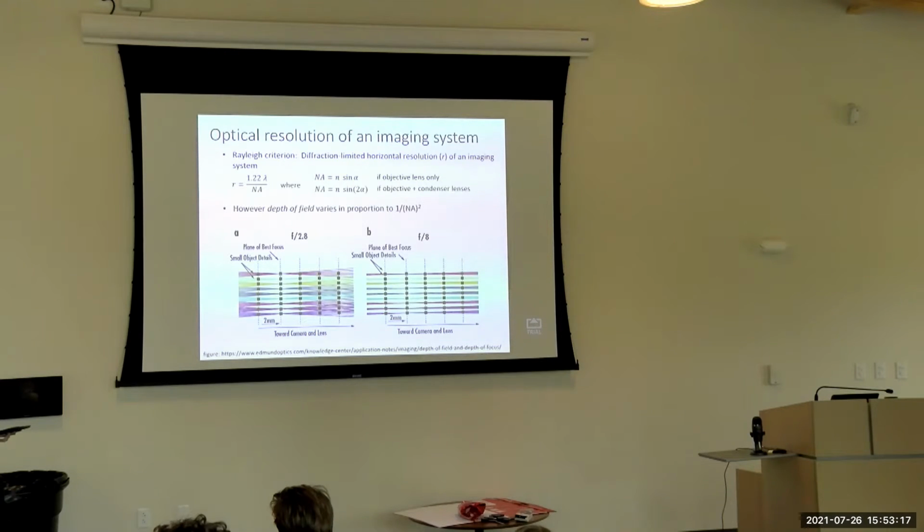If you play around with a microscope that's got multiple objectives, you can see this. You can get something in focus at a low power objective, and say, okay, I want to zoom in, switch to a higher power objective, and it's not in focus anymore. You have to wiggle it even more, do a little more fine tuning to bring it into focus, because the depth of field of that lens is shorter.